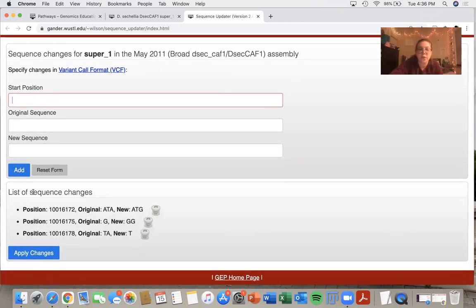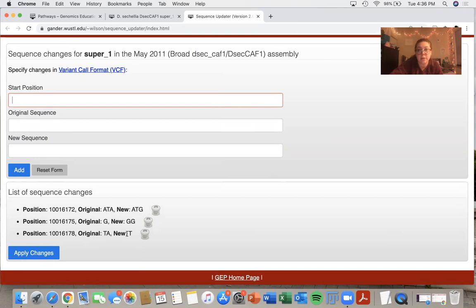So again, the first one I changed a base ATA to ATG. The second one, I added a base, an insertion. And the third one, I deleted a base, a deletion.